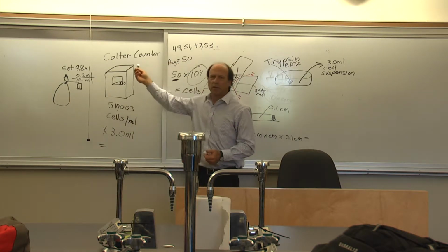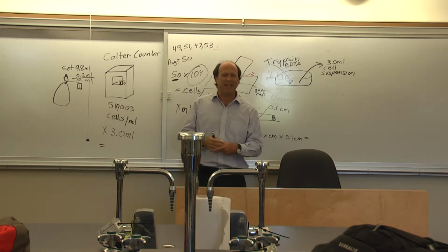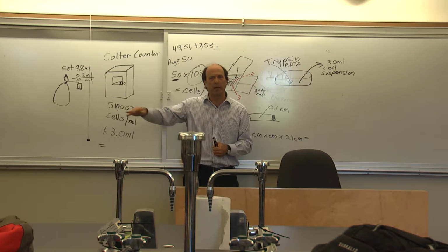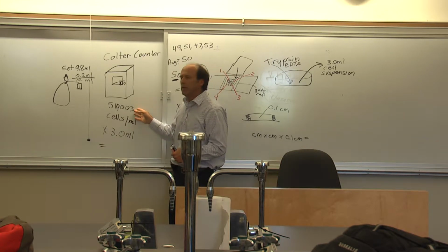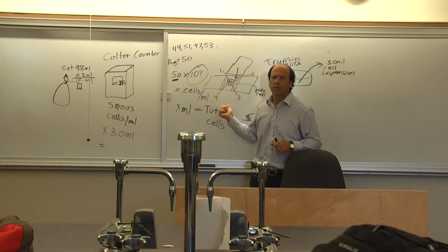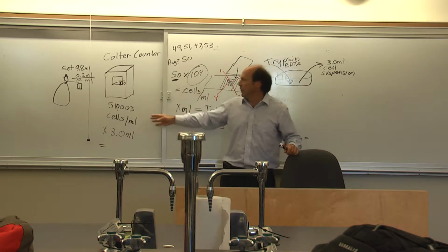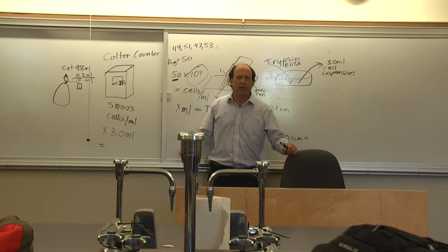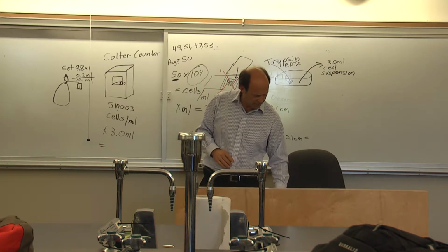So this Coulter counter is kind of new to us. I mean, we brought it out. It's been sitting underneath the bench for a while. But we recently learned how to keep it up and running a little bit better by rinsing it with a detergent solution when it's not in use and that kind of thing. So we're going to try to keep that going from now on. So that's kind of one of our objectives. We like it because this number is a bit better than what you can get with the hemocytometer. We trust it more, and it's going to be more reproducible. So if you want quality numbers for your growth curves, I think this is going to be the winner in the long term. In the short term, there might be a few moments where we struggle with it, but I think it's going to work out for us.